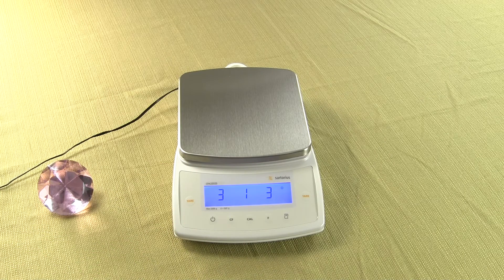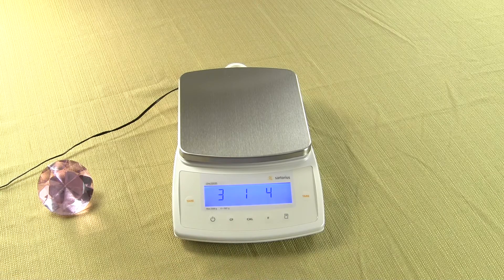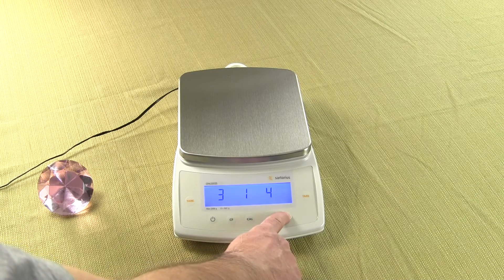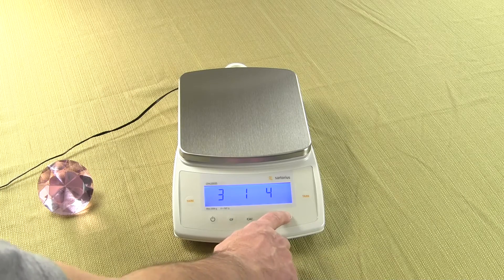We need to increment up to 3, 1, 4. To increment up, press the Cal key. We have 3, 1, 4, which we want. We need to store it. Press and hold the Print key until you see a little circle in the top right-hand corner.